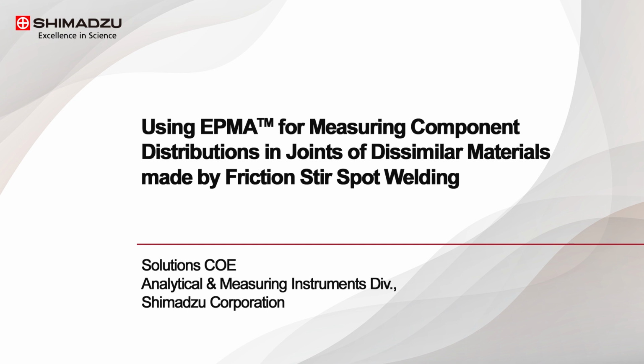And today I will be discussing using electron probe microanalysis, also known as EPMA, for measuring component distributions in joints of dissimilar materials made by friction stir spot welding.